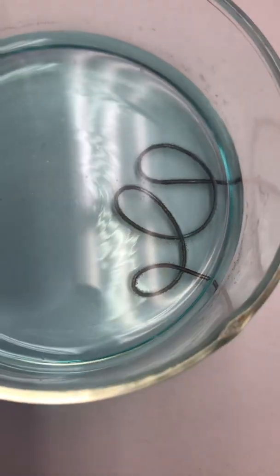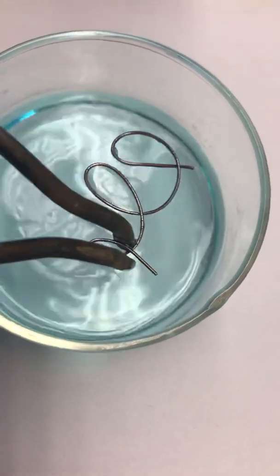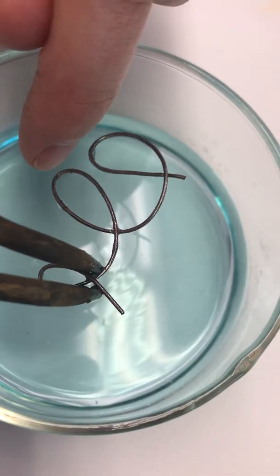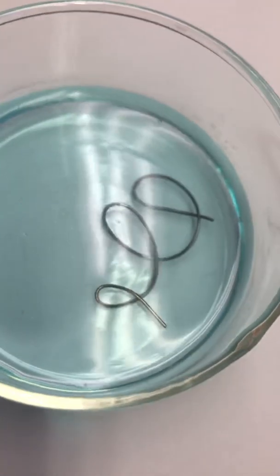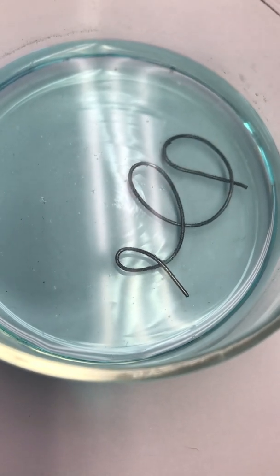Okay, so if I take this out for us to look at, and I'll put it back in. Okay. The color that we see is a red solid that's being formed on the surface of the wire. Okay. That red solid is a new substance being formed. Okay, it's not rust.